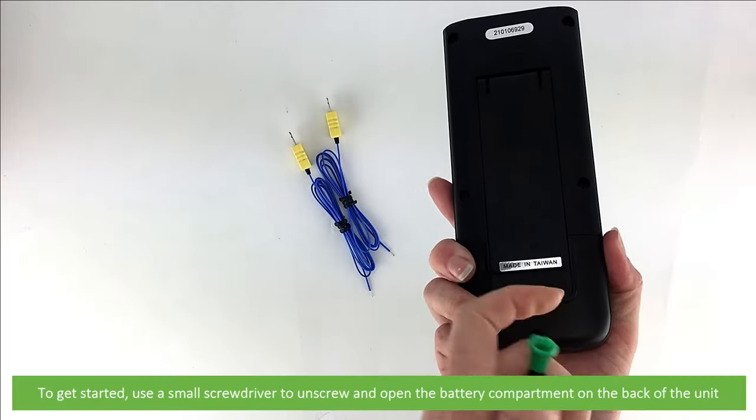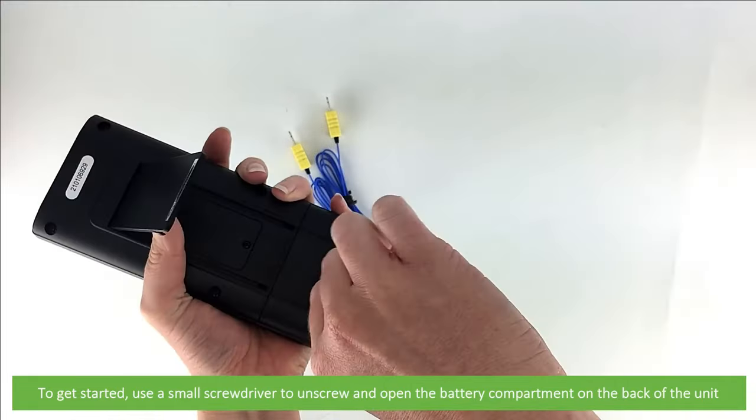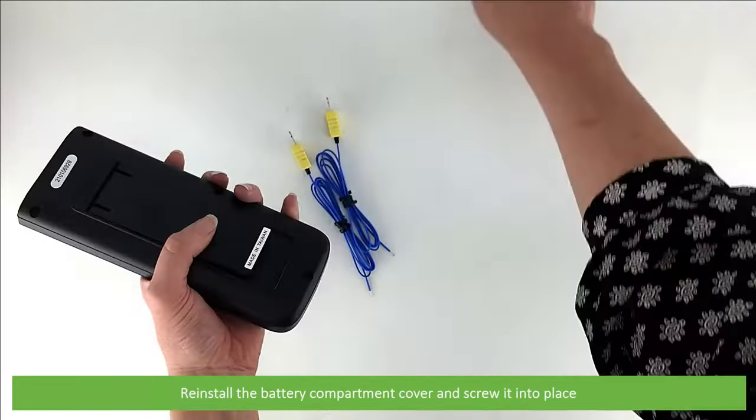To get started, use a small screwdriver to unscrew and open the battery compartment on the back of the unit. Insert the four included AAA batteries, then reinstall the battery compartment cover and screw it into place.